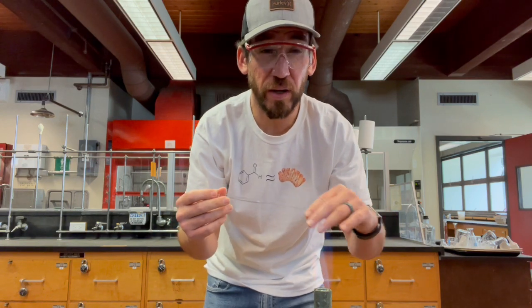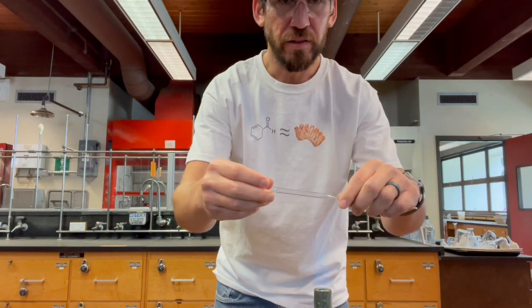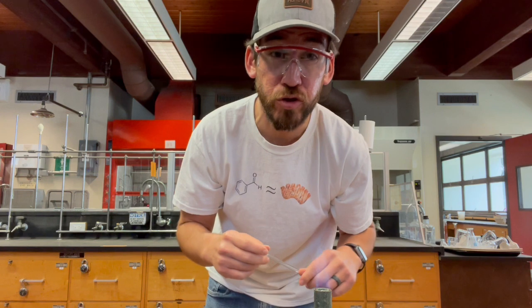This is actually a good way to make TLC spotters as well, because you can make them really fine, so that way you don't have a big blob on your TLC plate. If you have a big blob, you get big blobs going up your TLC plate. It's not a good one. Okay, so I took my gloves off too, because nitrile gloves are super flammable.